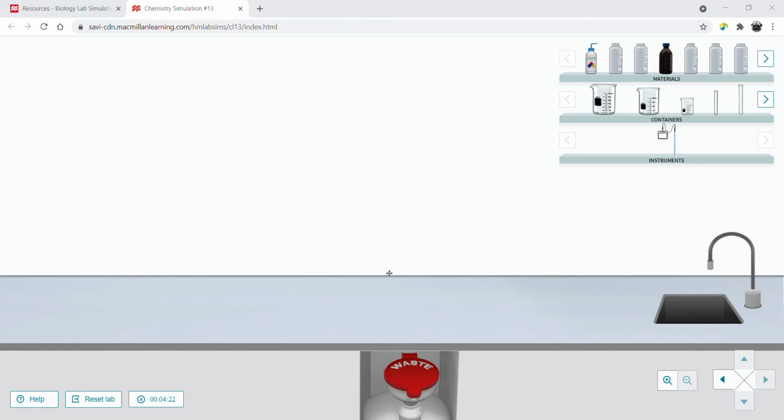So that should be lots of fun. We have a few experiments to carry out. The first one is going to test the pH meter versus a color change with bromothymol blue as your indicator. We're then going to test a buffer and its effects on hydrochloric acid. As you recall from your readings, buffers are solutions that, when added to an acid or base, resist the change in pH. They kind of counteract that whole show.